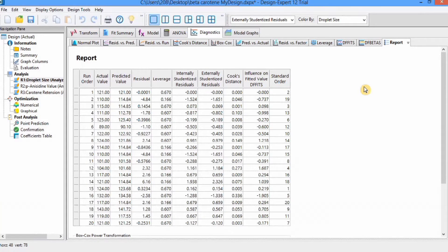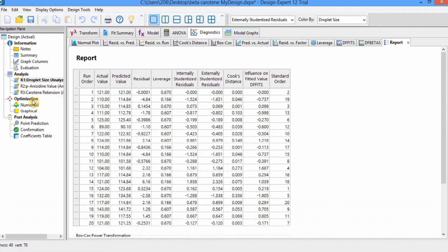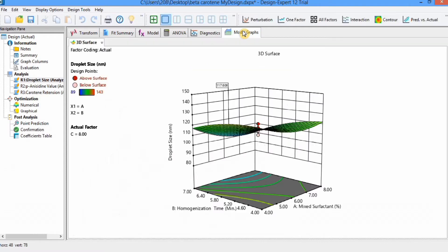In previous videos you have learned about how to design experiments as well as how to analyze data. In this video you will learn how to make model graphs and how to perform optimization for response surface methodology. Let's start this video by clicking on model graphs.